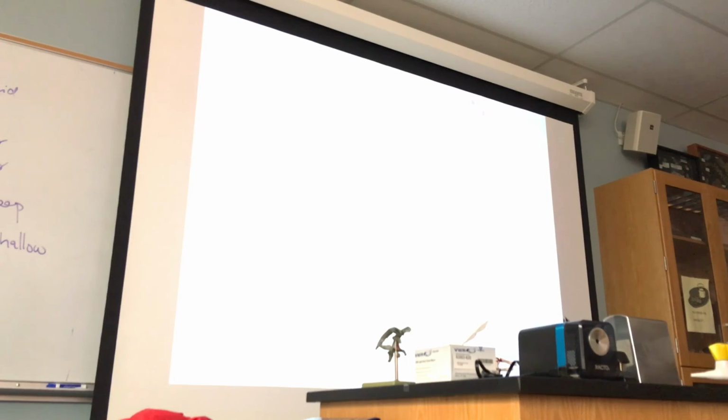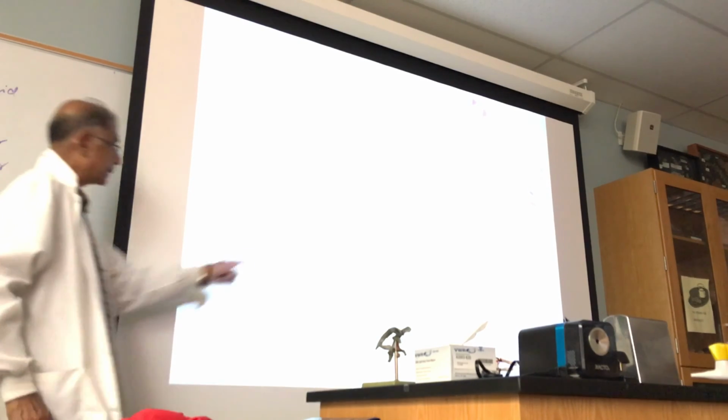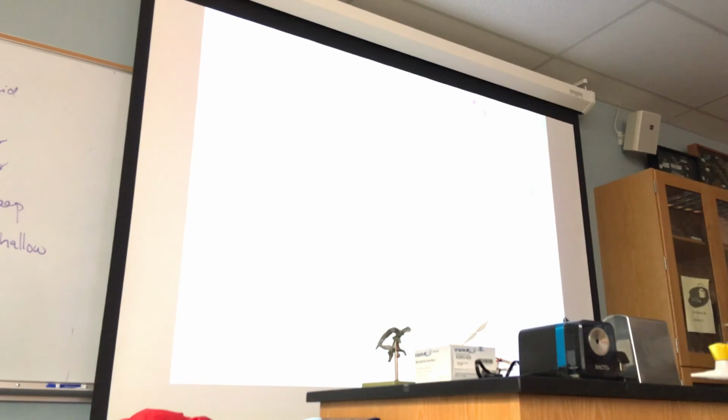Still remember? The opening? That hole there? This is the central canal, which should be filled with, oh my goodness, did I? Central nervous, CSF, yep, central. Yes, CSF.